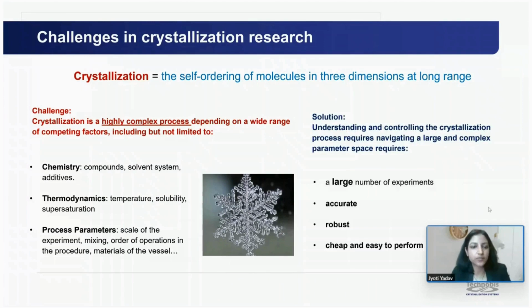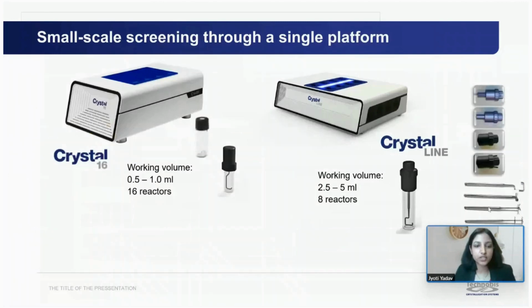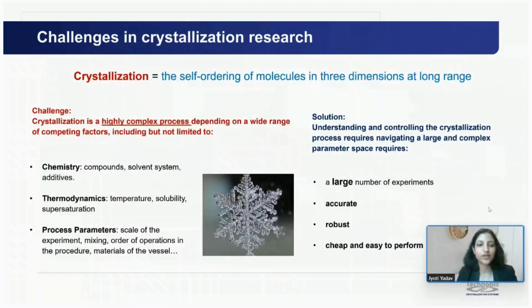Understanding the crystallization process requires a large number of experiments, and these experiments need to be accurate and robust, meaning they need to be replicated and verified under different conditions. And importantly, in today's cost-conscious environment, these experiments need to be cheap and easy to perform.